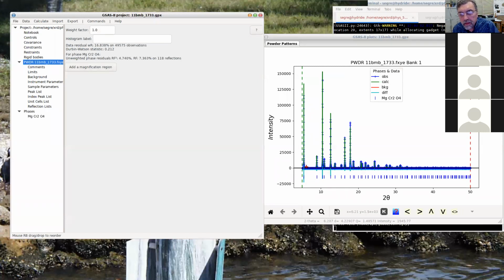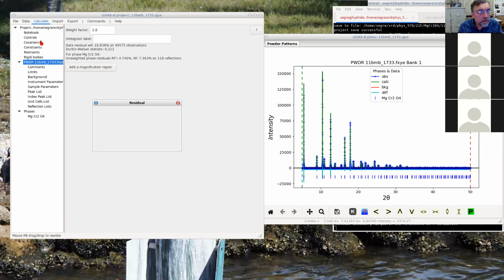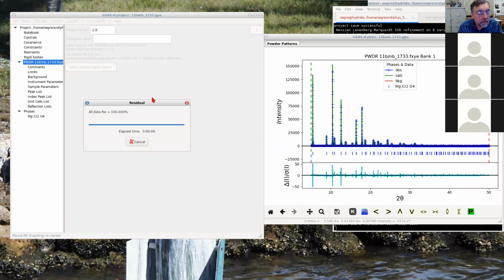Okay, so I've cut the data here. Let me see if this behaves a little bit better now. It doesn't look good. Yeah, there's something funky going on here. I wonder what it is. I'm not happy.